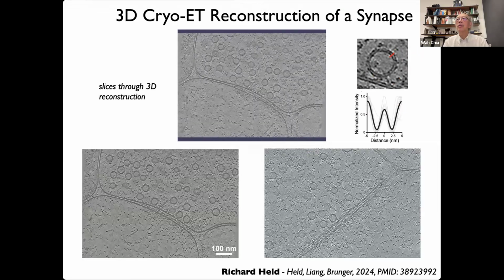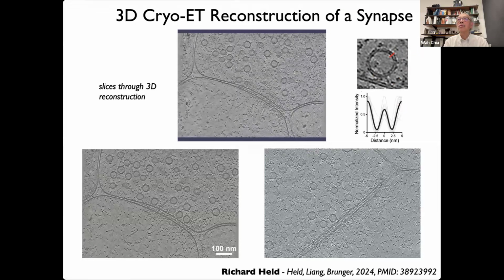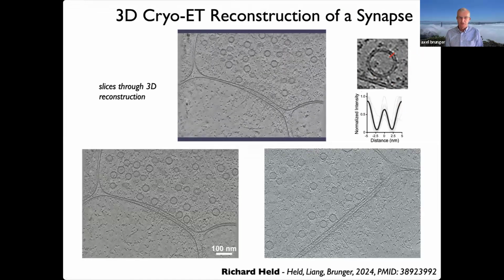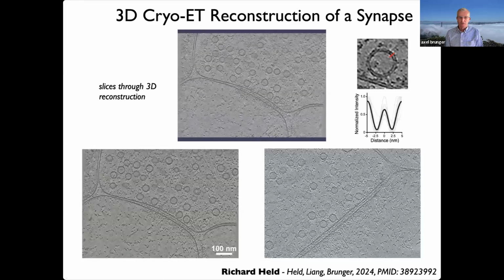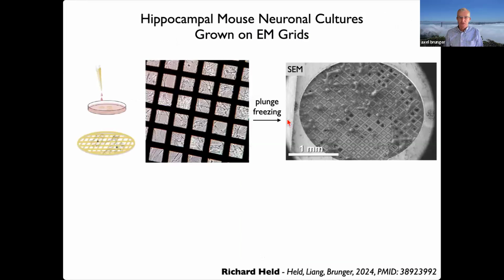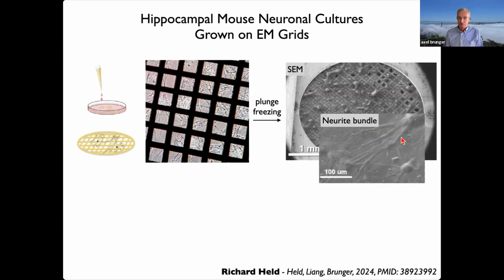Another question is, how difficult is it to target a synaptic site, and do you use any fluorescent labeling in the process? Very good question. We've been using fluorescent markers for active zones as well, and that works well. But in this case, we didn't necessarily have to do that, because just by looking at the SEM images and identifying these neural bundles, and randomly milling through some of these regions, you have a pretty good chance, about 50%, of actually capturing a synapse. Primarily these are excitatory synapses, and you can easily distinguish between excitatory and inhibitory synapses. So for this project it wasn't really essential to use fluorescent labeling, but moving forward and looking at more specific questions, that is something we're clearly also doing.